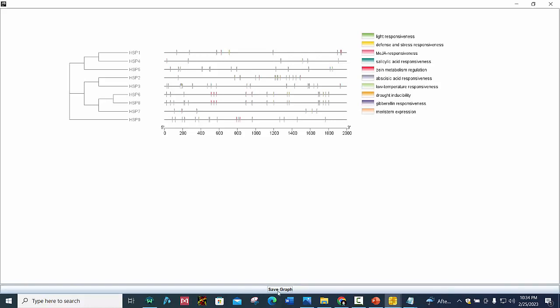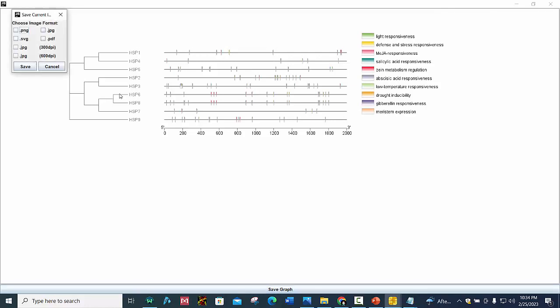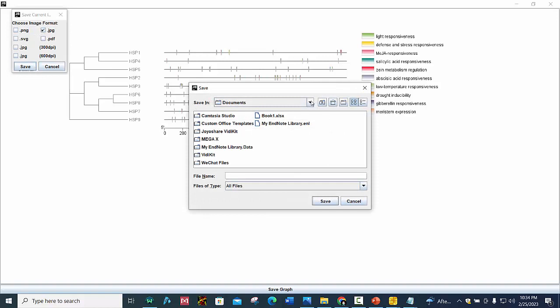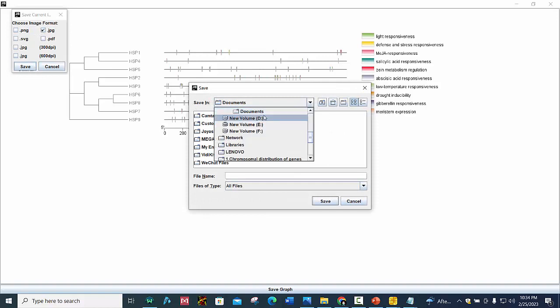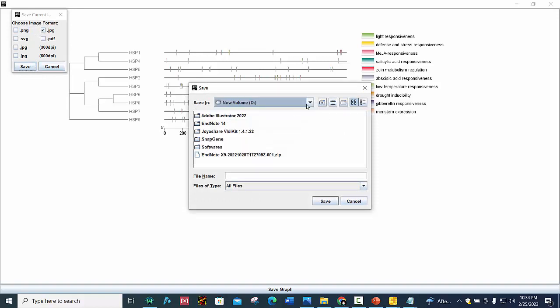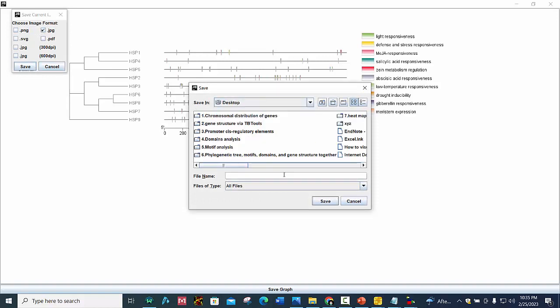And then you can save this graph. Cis-regulatory elements in promoter region.